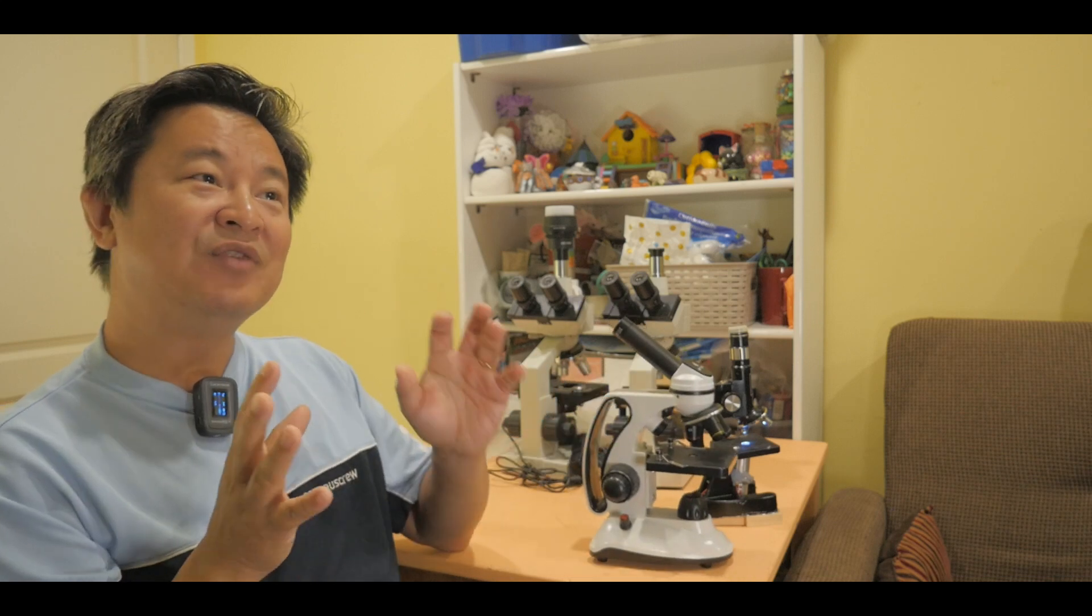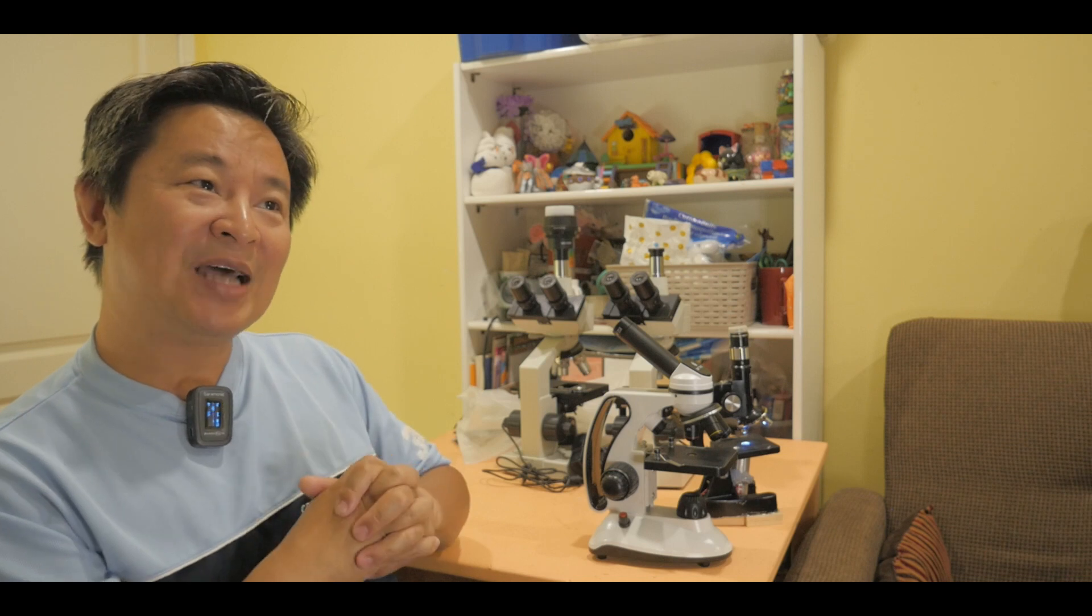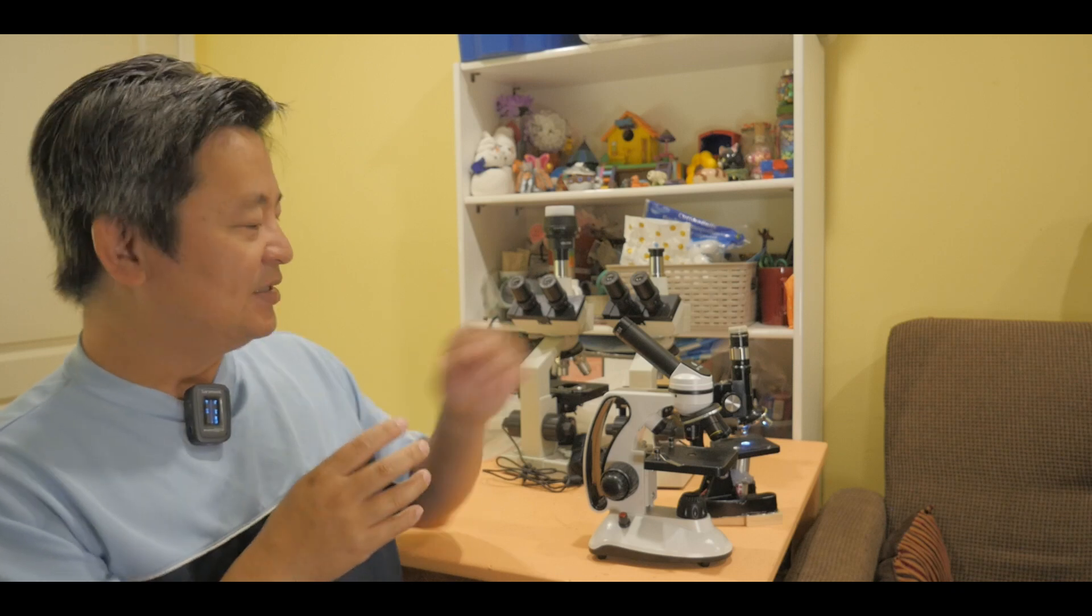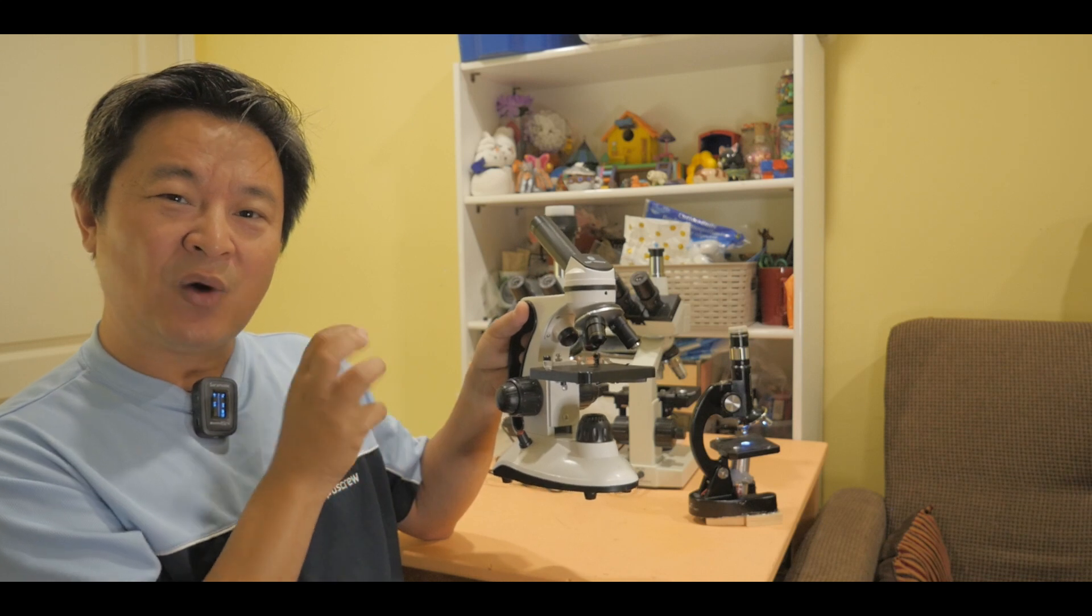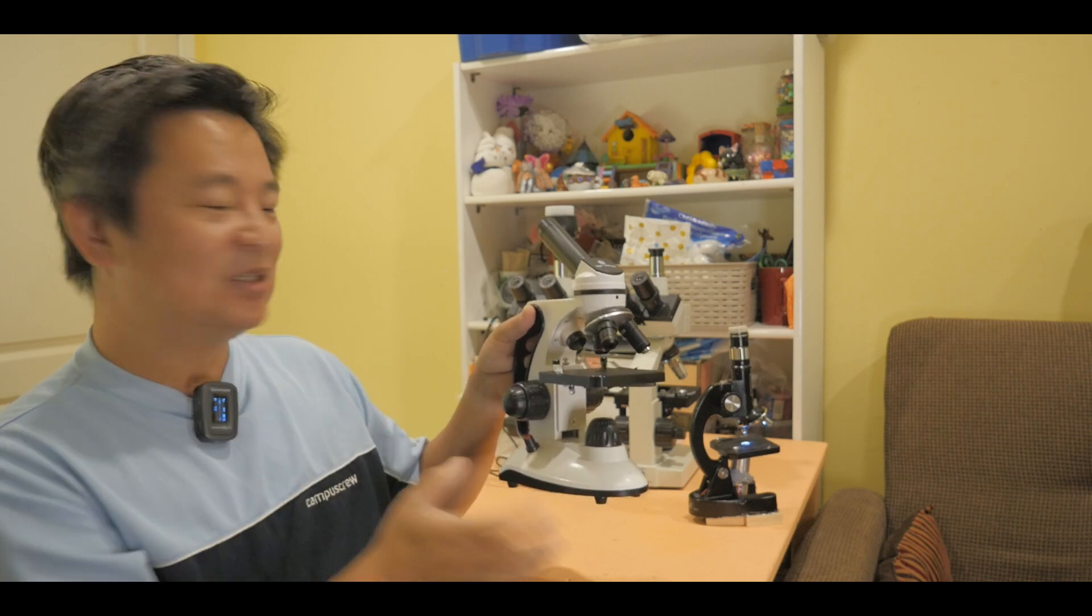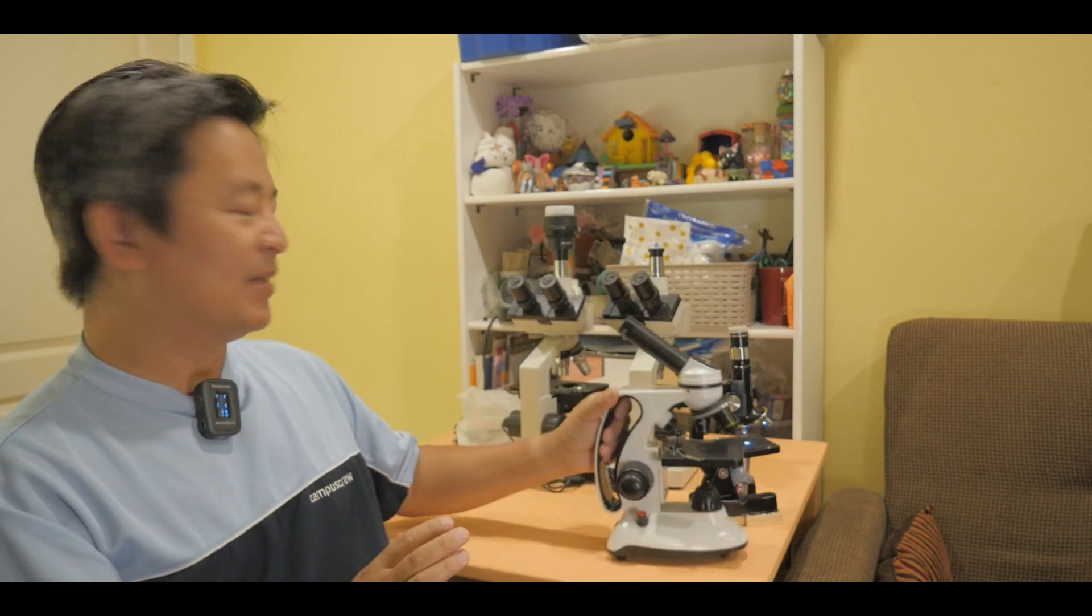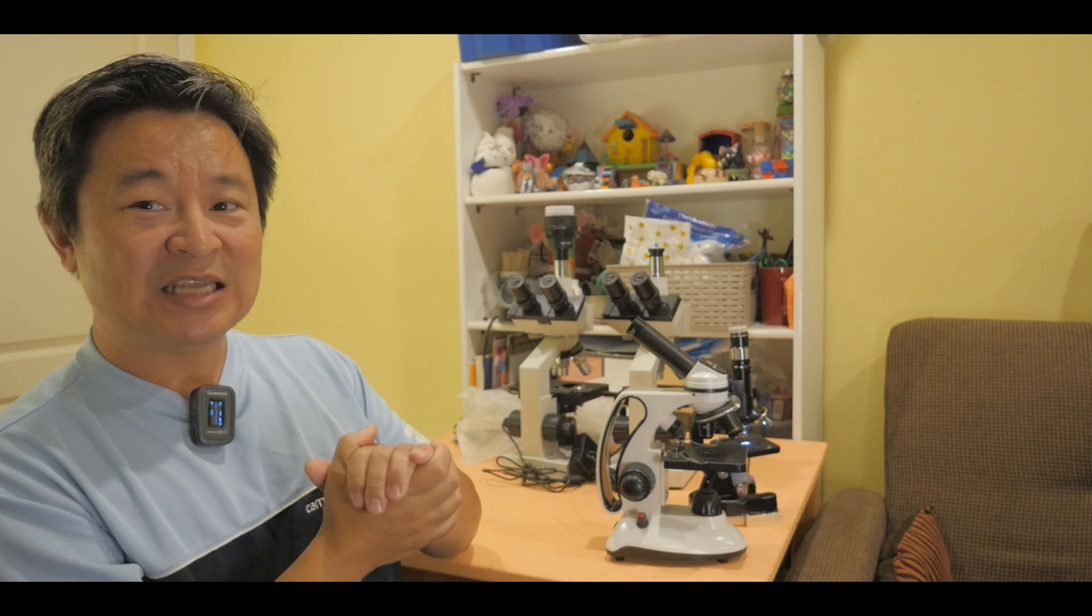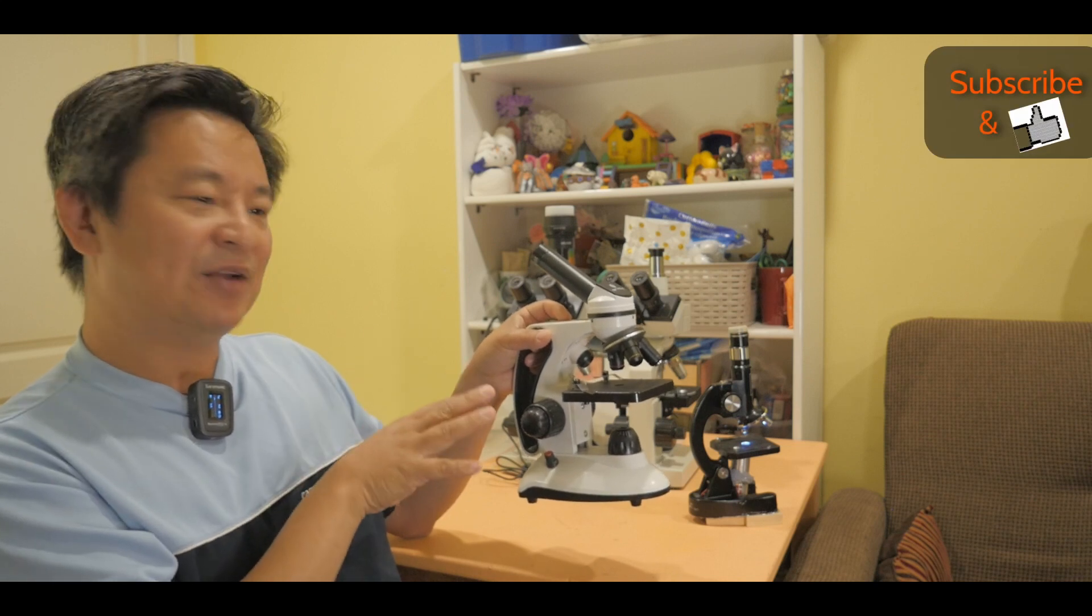So ideally, if you're going to get a thousand times with oil immersion type of objective lens, then I'd say that's really good. So when they're trying to advertise that's 2000 times, avoid it with a plague or consider the fact that that is not the right description. In fact, this type of microscope, if you're lucky, you can get it around 400 to 800 times in magnification and resolving quality type of image. If you can get that, that's great. So this type of microscope, you can get a 400 to 800 times. I think that's a good deal and avoid that at the same 2000 times. It's even the best microscope can't do 2000 times with even the best type of objective lens and ocular lens. So that's the thing with the advertisement. I don't know why Amazon and other online company allow that kind of advertisement. That is just false. But knowing that you're going to get a microscope for about a hundred dollars, magnification is around 400 to 800 times. I think that's a good buy.